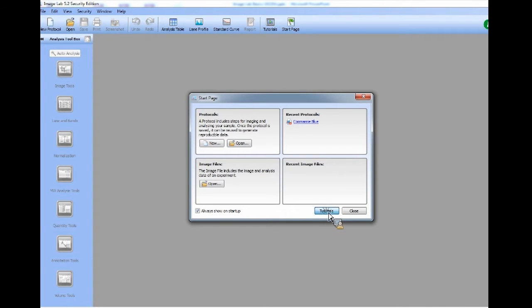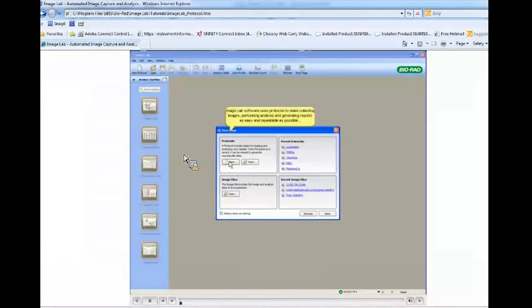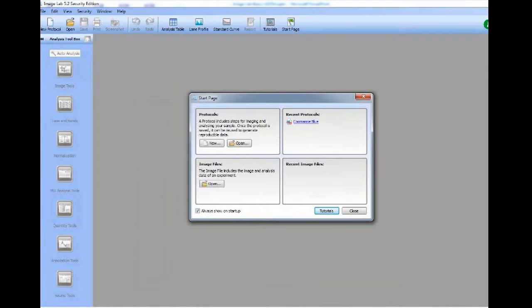If I were to click on the tutorials button, the ImageLab tutorials appear. Now, whether you're a first-time user to ImageLab or if you're a seasoned user, coming back here for a bit of refresher is always a good idea. I find myself coming back here often to look at different videos that are available under these video tutorials. Always a good place to check back for some of the functionalities. So I'm going to close that out and I will close the startup page.